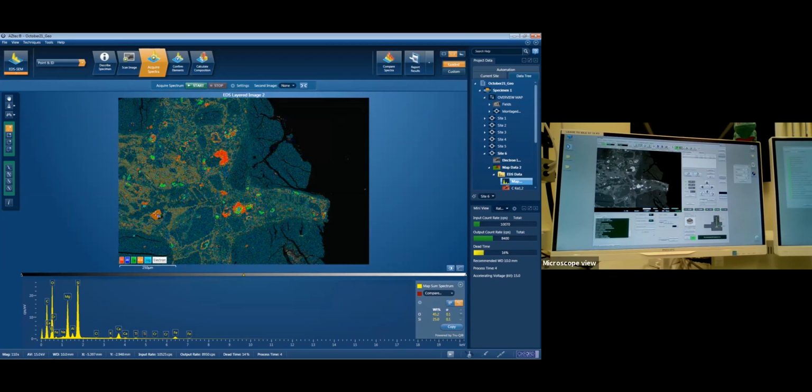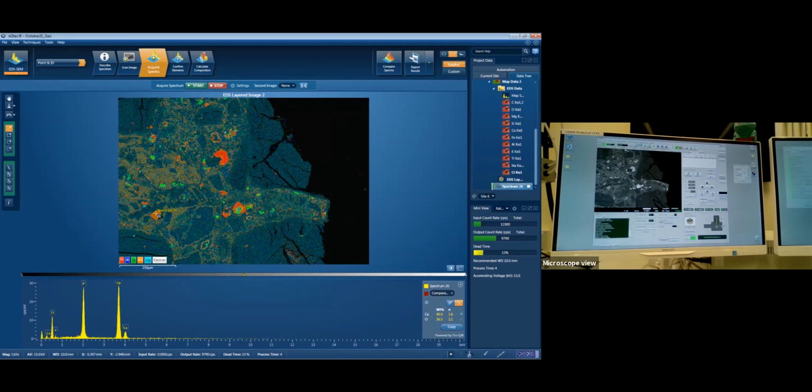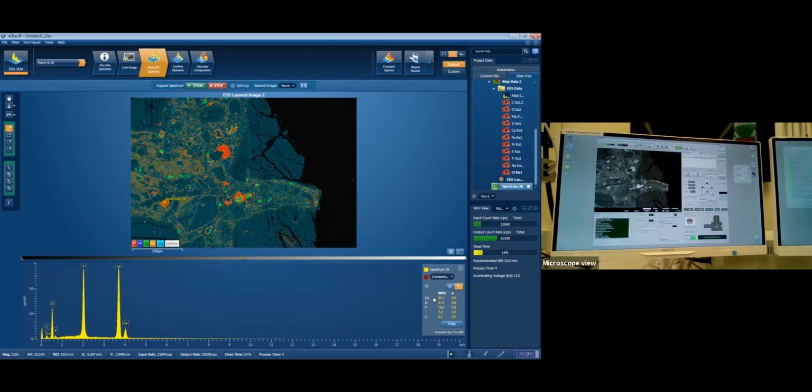We want to look at this one. If I show the whole thing. Oh, so this is calcium, oxygen, and phosphorus. In my head, P should stand for potassium, and I always get it confused. And I've got a PhD and should know better. So this is a mineral called apatite.